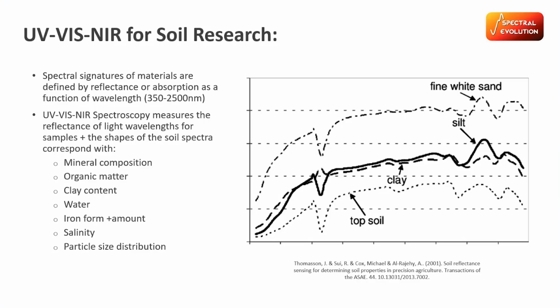With the same data that you collect in the field, you wouldn't just have to use it for nitrogen. You can use it for mineral analysis as well as some carbon quantification, with the same scans. So you can get a lot of information out of these scans back in the lab after you've done your field collection.